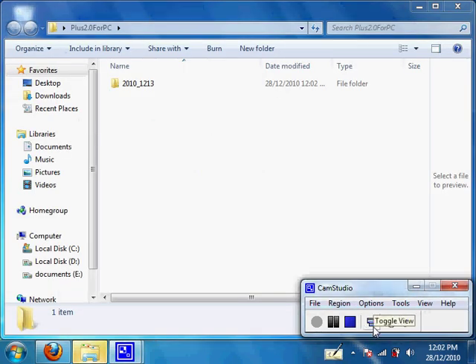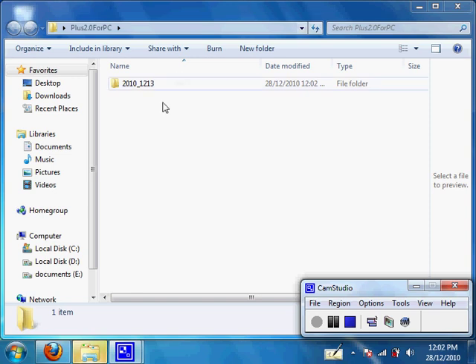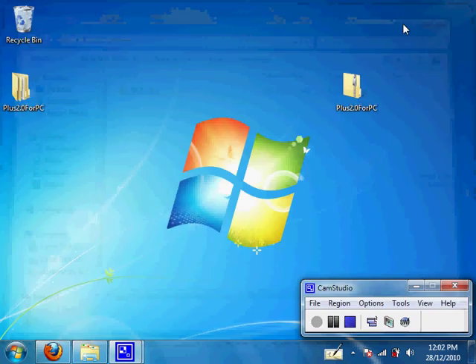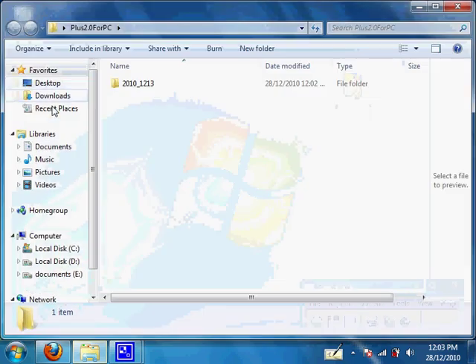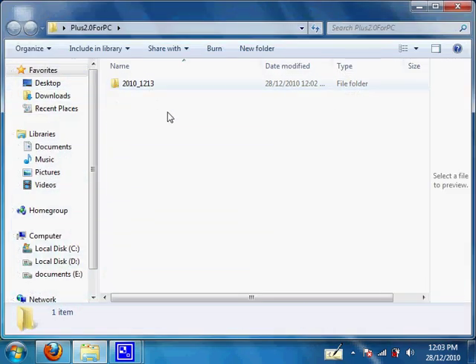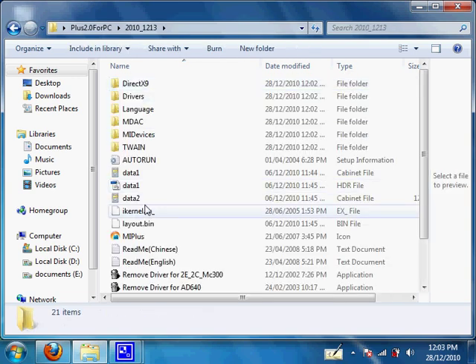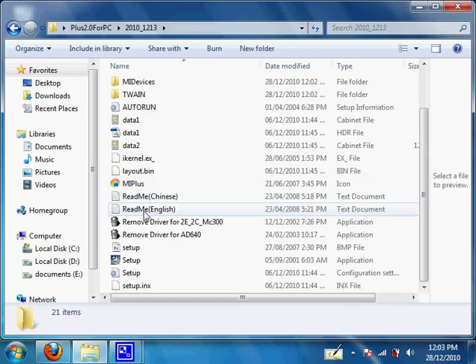Once it's done extracting, the extraction window will close down and the extracted folder window will pop up on your desktop. You know for sure that your file is extracted because it appears on your desktop. You can double-click inside and you'll see the setup file — the version number may be different depending on your software. Just go inside and then click on Setup.